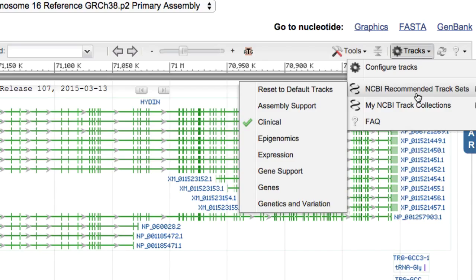On the other hand, if you are interested in transcriptional regulation of Haydn, you might choose the Epigenomics track set, which will update the display with an emphasis on tracks indicating genomic regions at which regulation may occur.